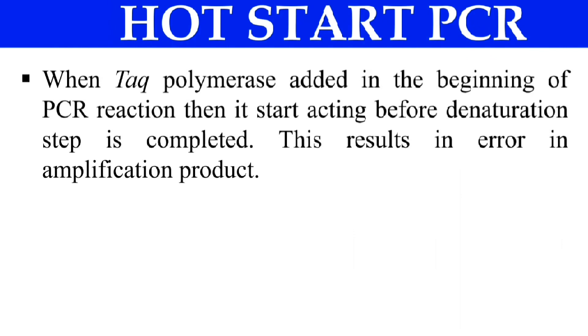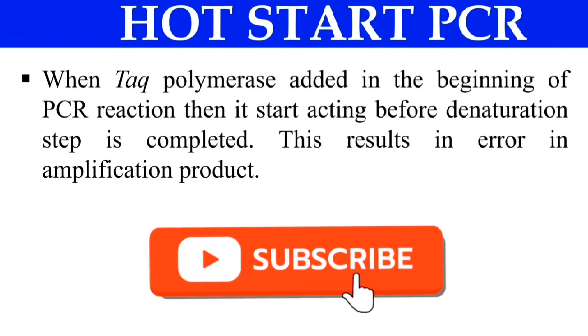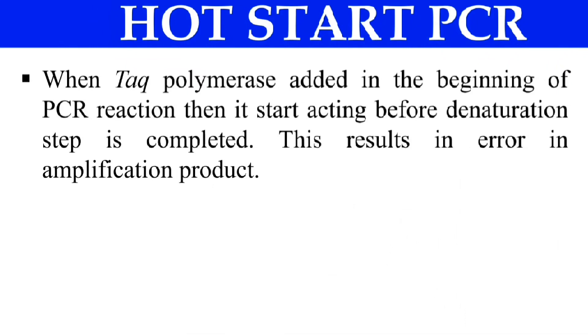What exactly is hot start PCR? Just imagine that when we add the Taq polymerase in the beginning in the PCR mixture, the first step — as we know — is denaturation, which is usually done at 94°C, and the Taq polymerase acts at 72°C. As the temperature rises from 72 to 94°C, the Taq polymerase starts acting before the denaturation step.